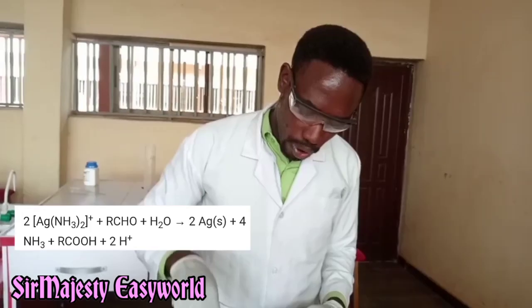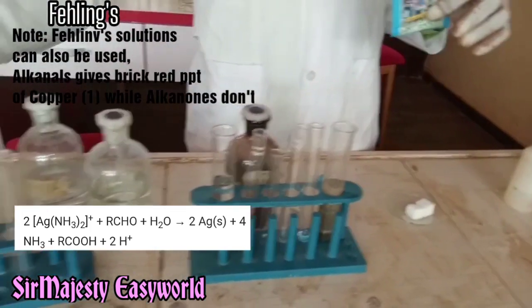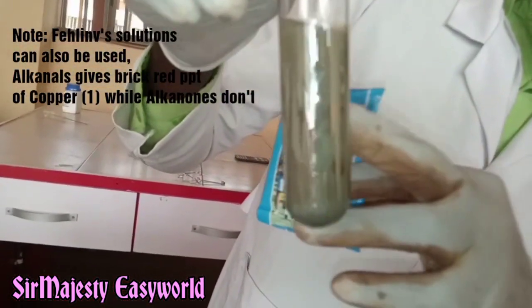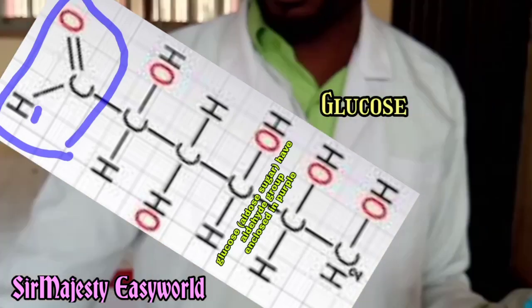So what we are seeing here on the walls of the test tube — this is very, very clear, this is becoming obvious. You can see at the walls of the test tube we are seeing a silver mirror there. So this is silver metal, which was gotten from the diamine silver(I) ion, which is a complex ion. So this shows clearly that aldehydes are reducing agents, while ketones are not.